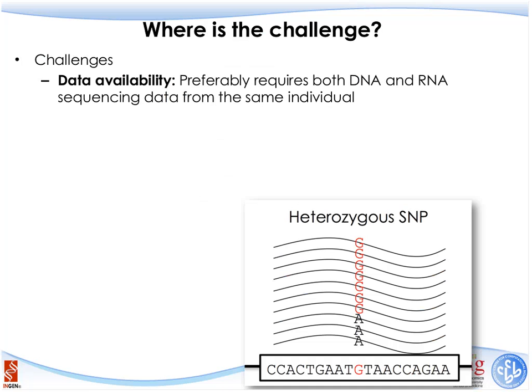One may ask, since the RNA sequencing transcripts already have the variants here, can I just go ahead and call the heterozygous variants from the RNA sequencing data? For example, the example listed here, you can see clearly this is a heterozygous variant that has A and G alleles. The answer is yes, you can, but in some situations this may cause problems.